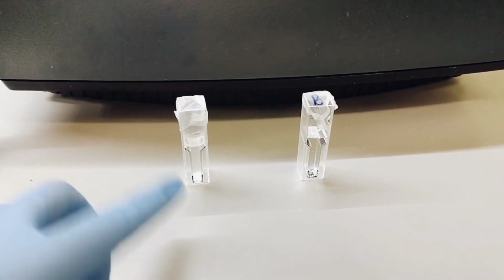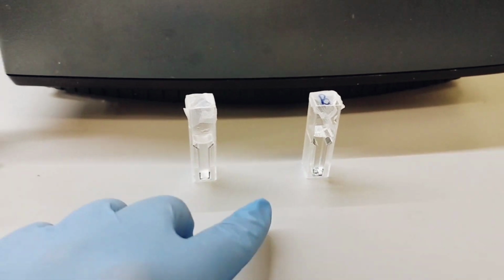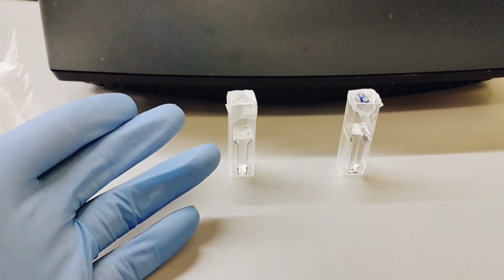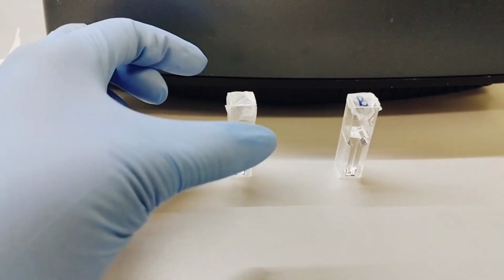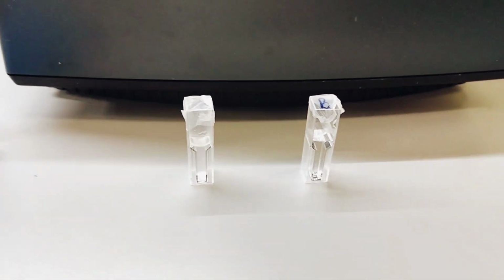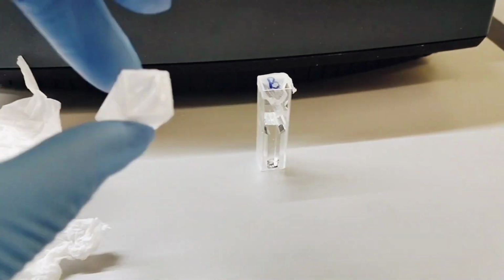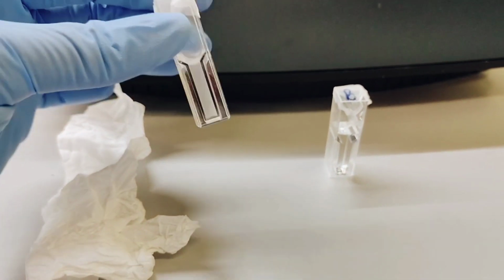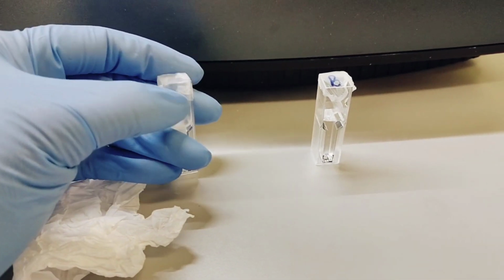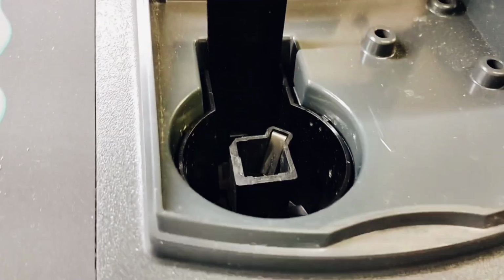But when using cuvettes, you want to wear gloves, and then you want to wipe the outside of the cuvette, because your hands have oils, fats, your DNA, and that will get onto the cuvette, and then you'll get a false reading. And so yeah, you just wipe the outside. The edge is covered, but there's an upside down triangle, and that's so you know which direction to put it in.